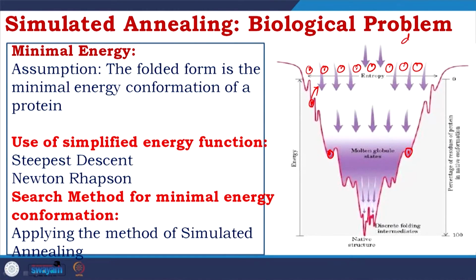First of all, you use that random number as a function and you perform dy/dx. When dy/dx is equal to 0, you are confirmed that you are at a peak. It could be maxima, it could be minima, but you attain a peak.